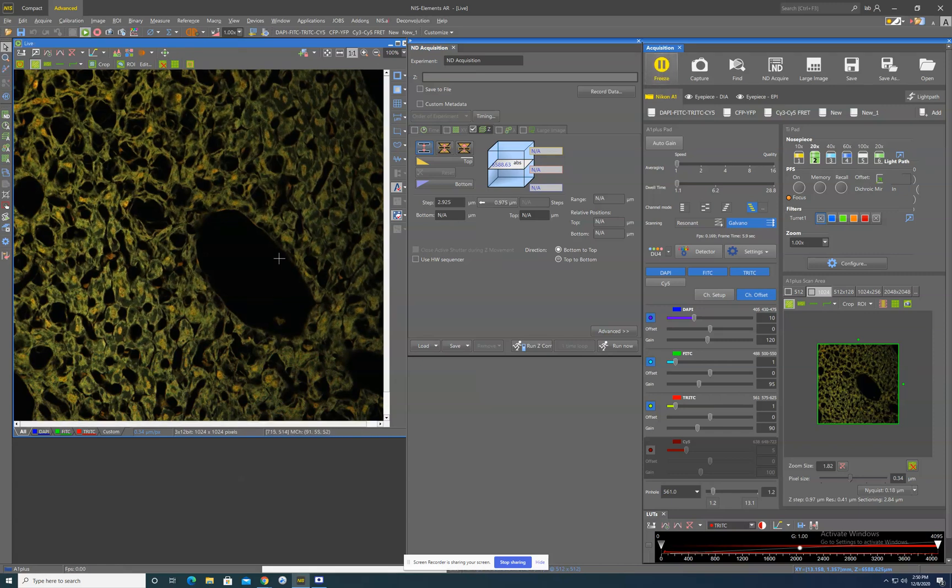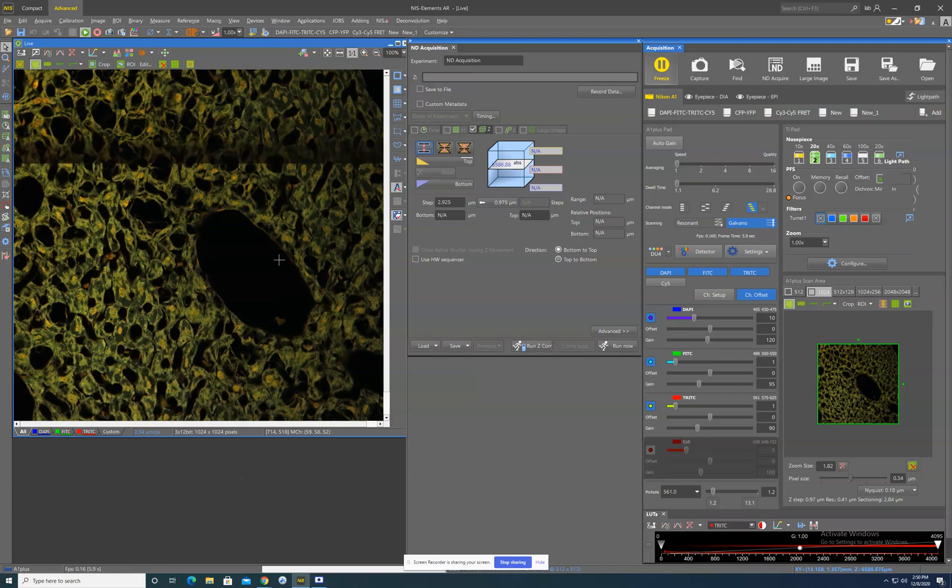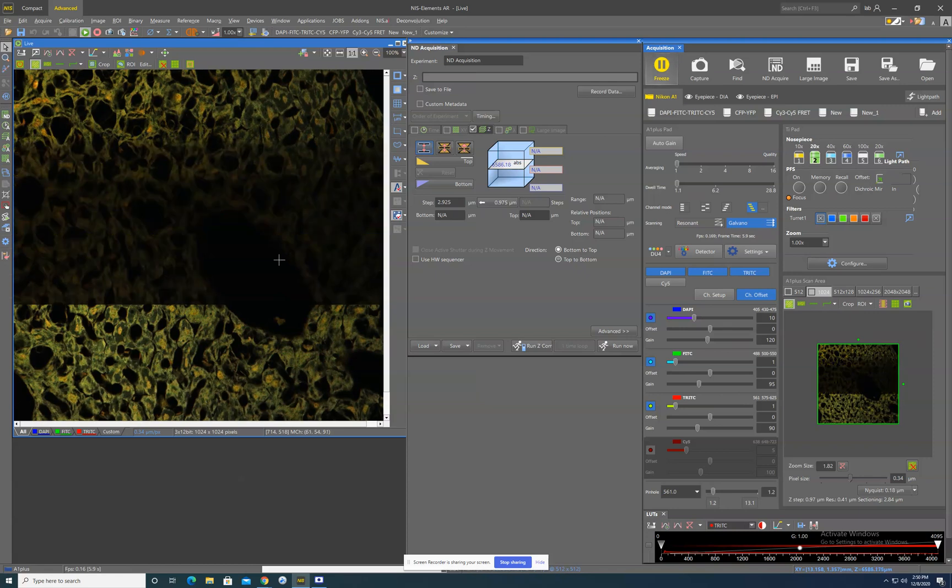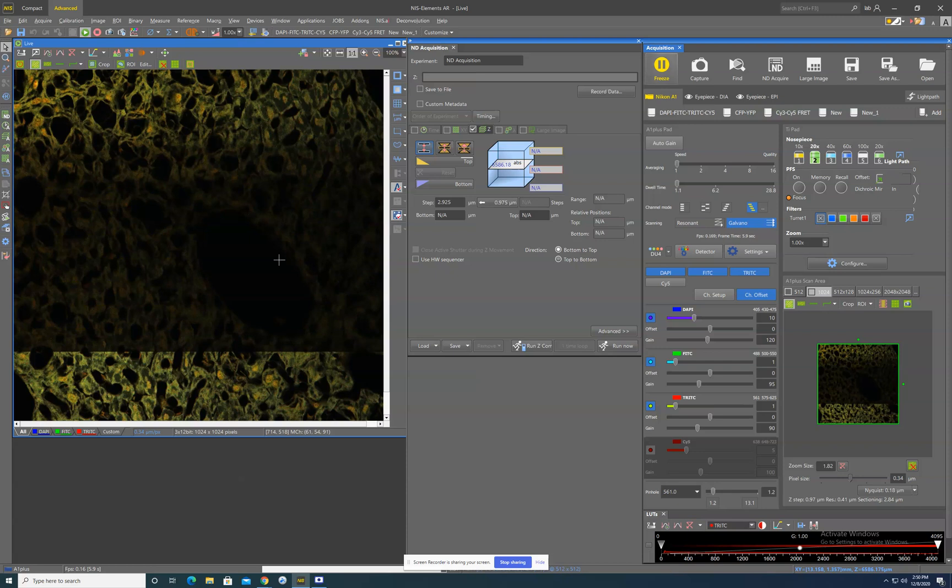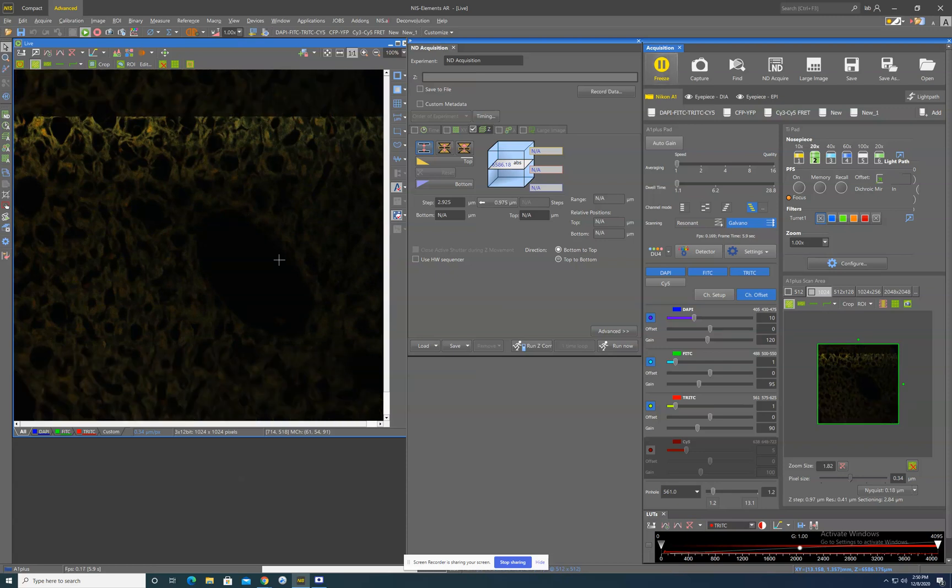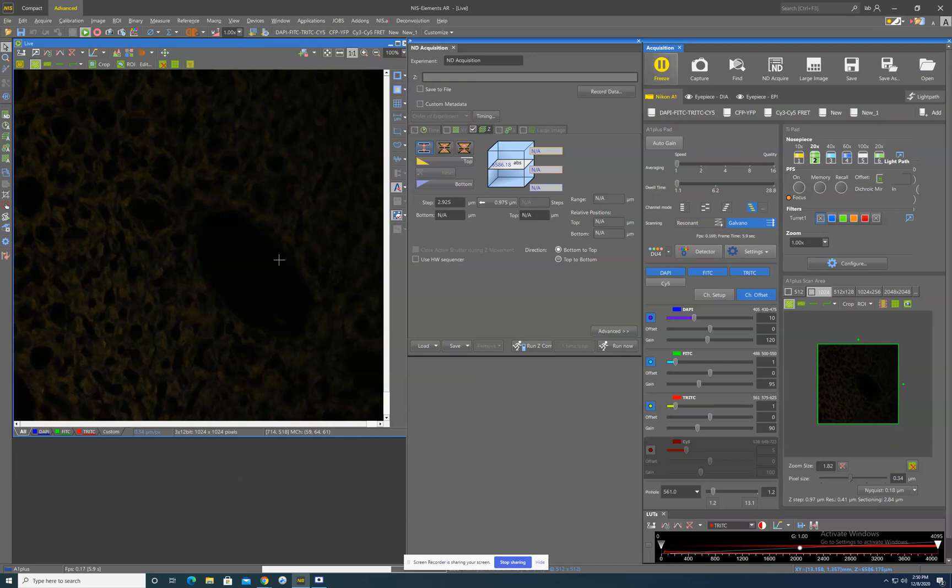I'm basically going to manually adjust the focus knob here and go to some point that I define as the end of my range of interest. So we'll say I don't care about anything beyond this point. We'll say that this is the top of the range I want to image.